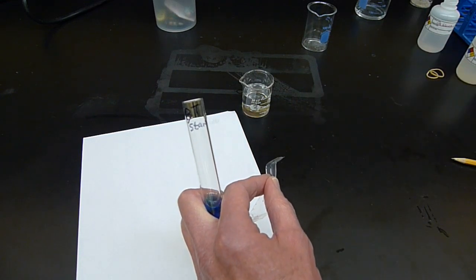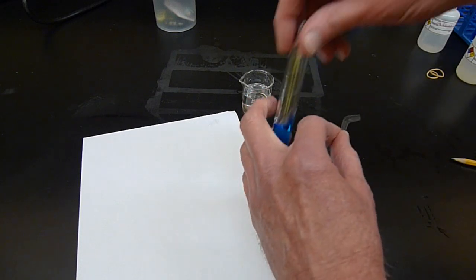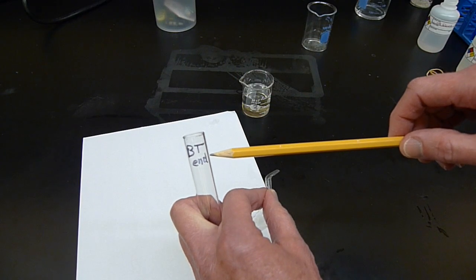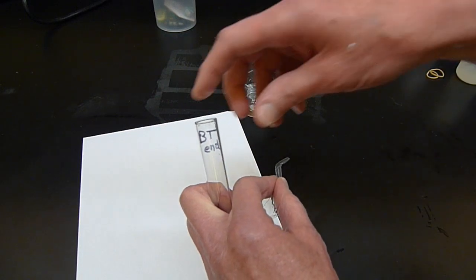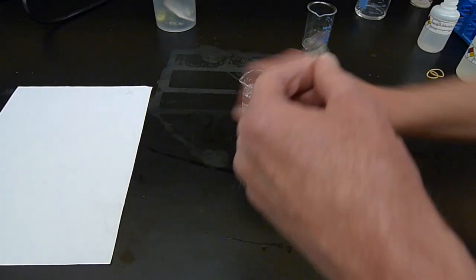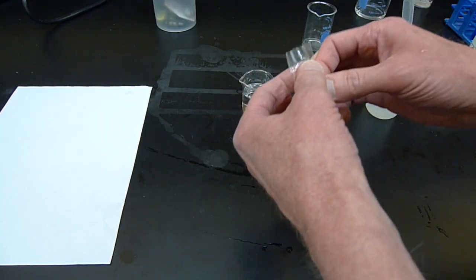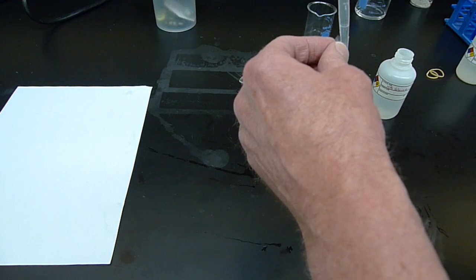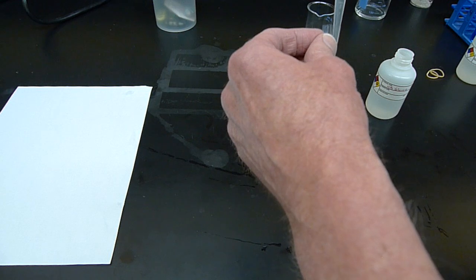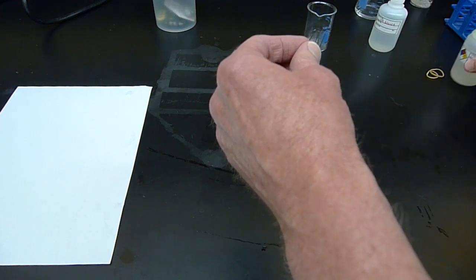I'm going to take some solution out of the beaker right away. And then the other one is labeled BT at the end, so for Benedict's test at the end of this procedure. So I'm going to put in some glucose solution first. Fill the bag about halfway full with glucose. And then do the same thing with starch.